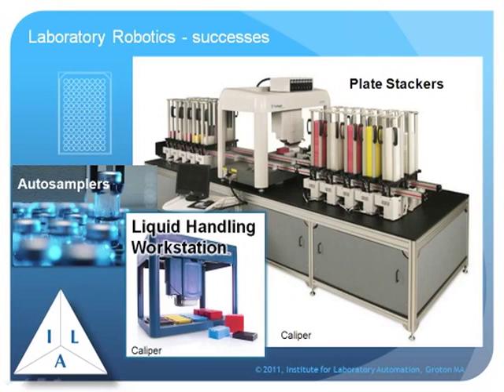The diagram in the upper left-hand part of the screen is an illustration of a microplate, or sometimes called a microtiter plate. It's a fixed geometry plate, and the one that's depicted has 96 wells. Each well acts as a sample chamber, and the ones that are being developed now are starting to run in the thousands.